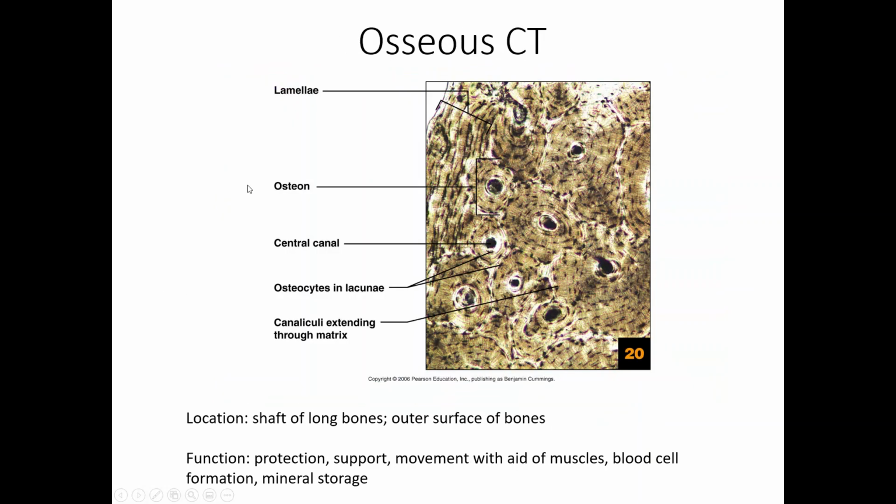Okay, osseous tissue. Okay, this is your bone, but we really like the science word, osseous connective tissue. Do not write compact bone on your exam. It's osseous connective tissue. Students usually don't have a hard time visually identifying osseous tissue. There's really nothing else that you're going to see that looks even remotely close to osseous tissue. That's usually not the problem. They do sometimes forget that they need to know a few extra structures.